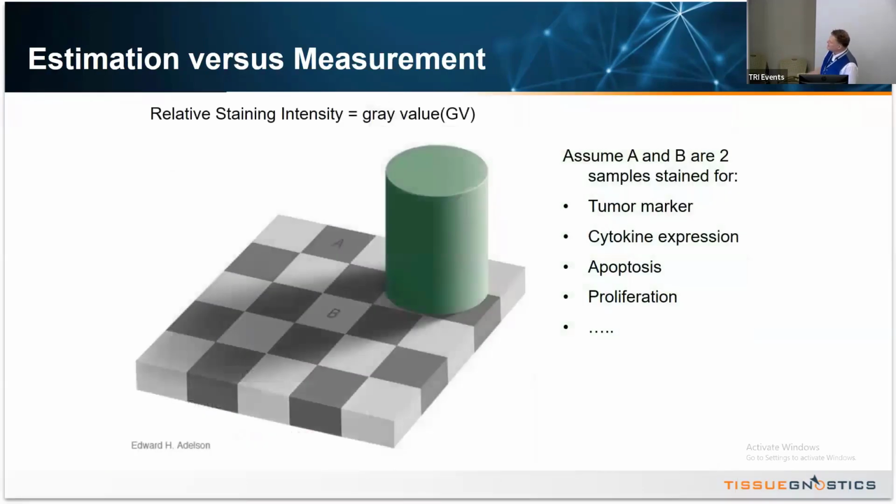This comes from the fact that region A is surrounded by brighter areas, while B is surrounded by even darker areas. And by looking at it, our brain, which is a very powerful interpolator, gets active and starts to show us things which actually do not exist.